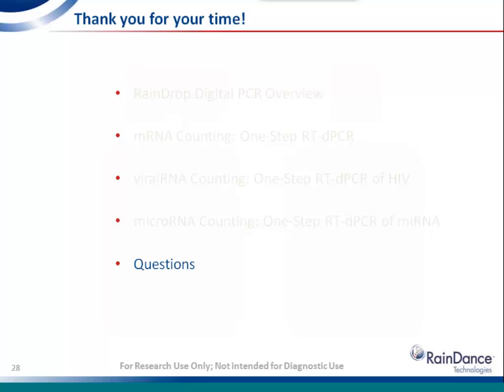Our first question is, what is the minimum and maximum amount of RNA and DNA to test? So that's a great question. It's very straightforward to put limits on the system when you're counting DNA, because the typical mammalian cell has 2 copies of any species of target.